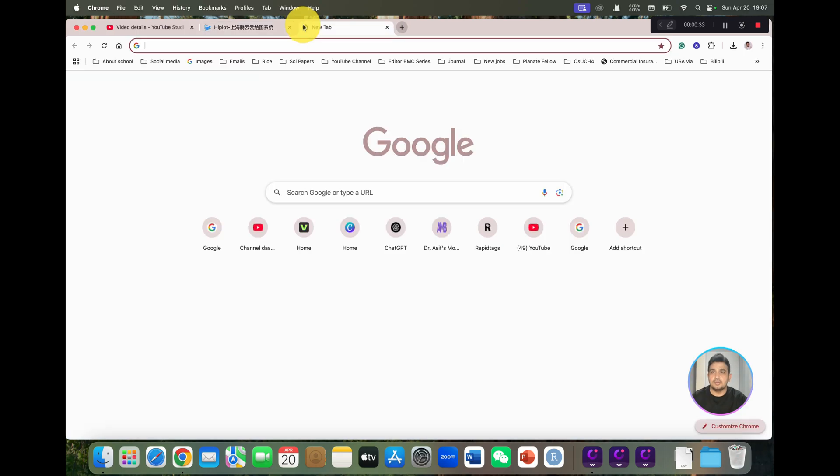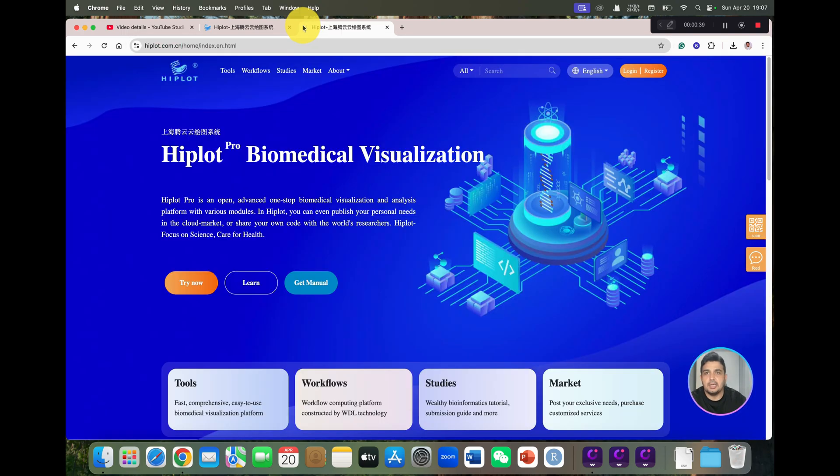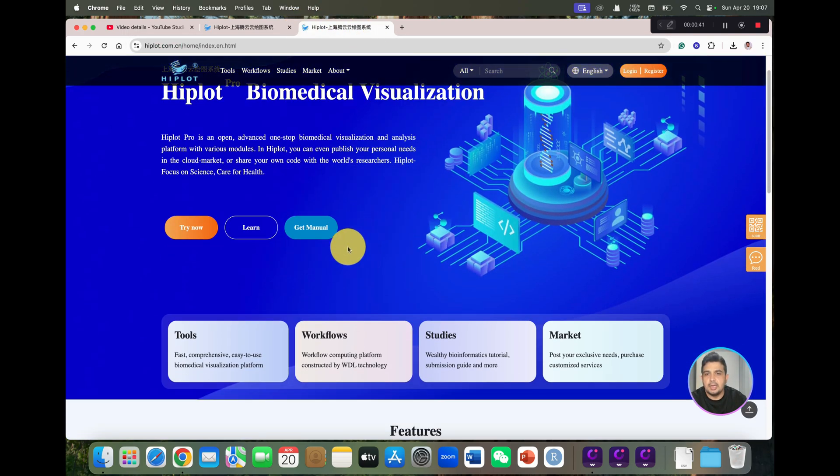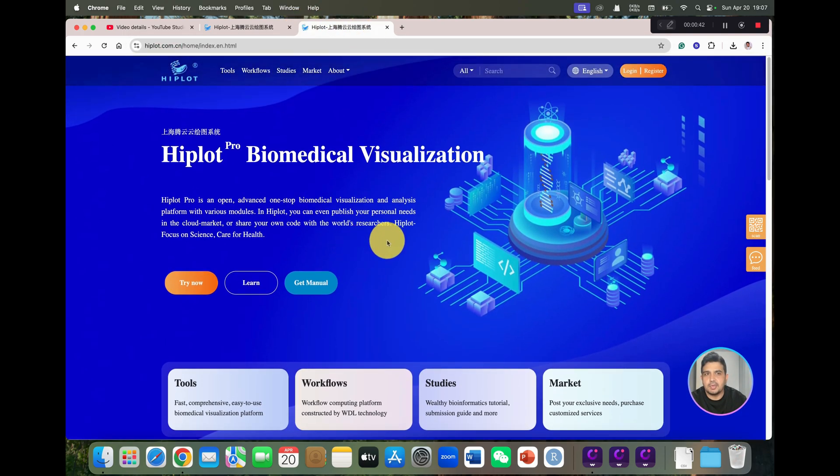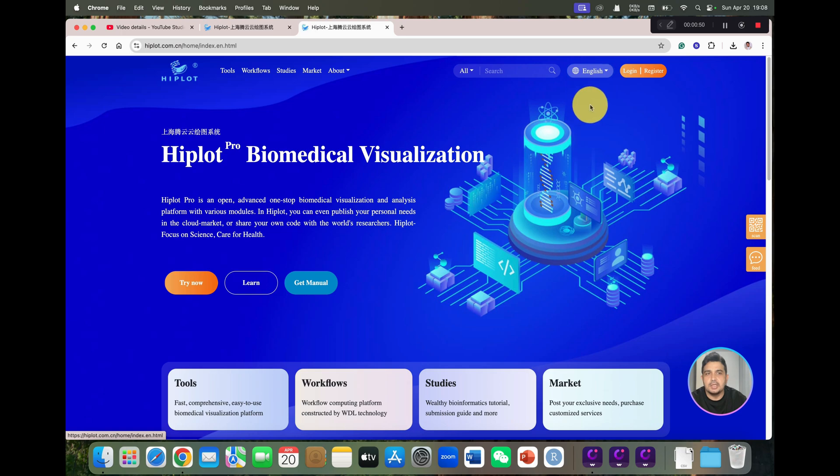You can write hiplot.com.cn. Once you click on this, you will land on this website. As you can see, they have different versions, one in Chinese and one in English. I have already selected the English version.